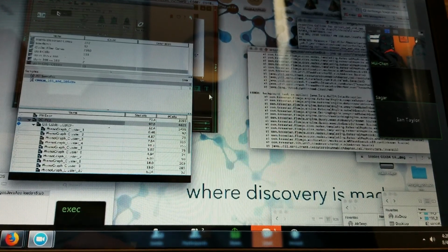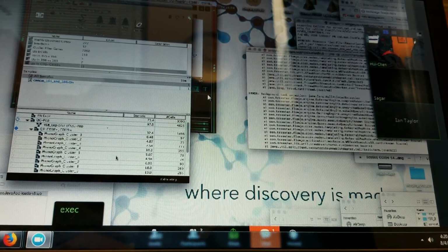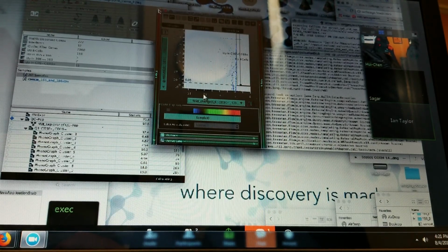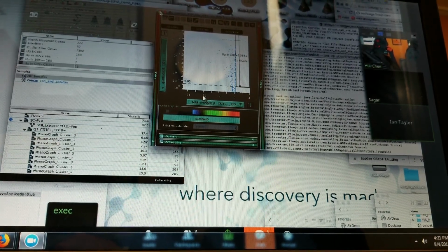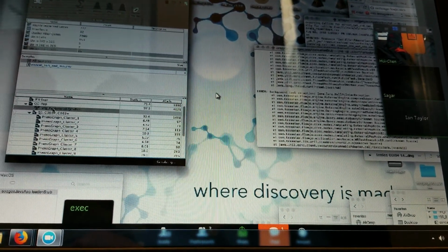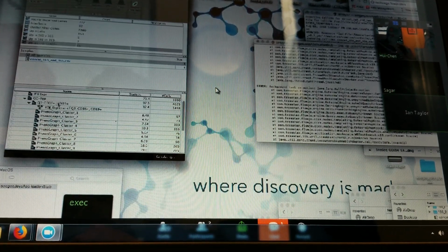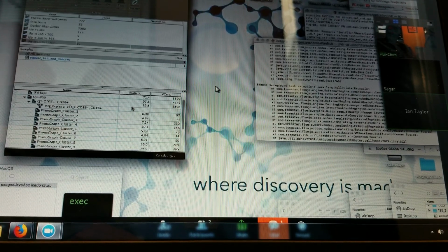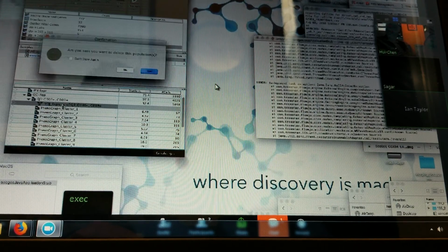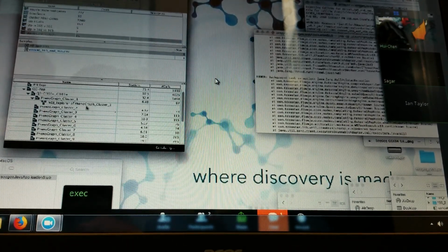One more time here. Are you going to do all the clusters? It'd be great if you can do them all at once. Exactly. I was hoping to look at how each of the clusters' different clonotypes look. Though it doesn't seem to want to run at the moment. Try one more time. Too much power. Maybe just try one cluster? Yeah, compare two. It shouldn't matter. We've done this with really large data sets, and it should be able to.